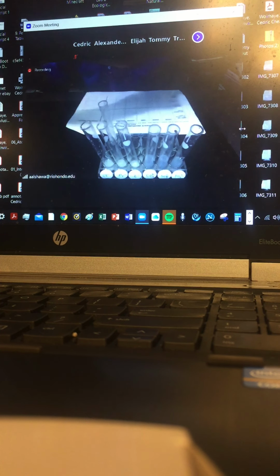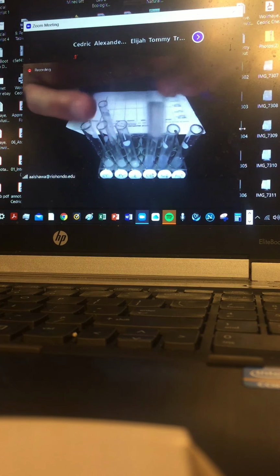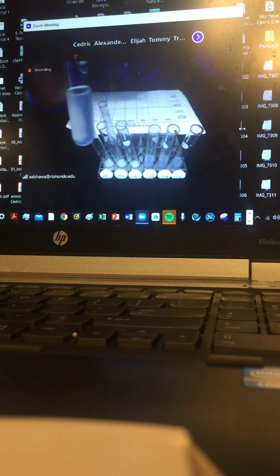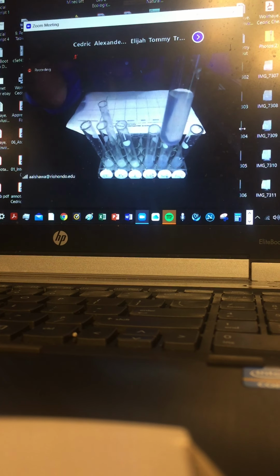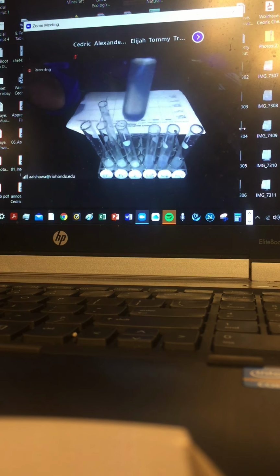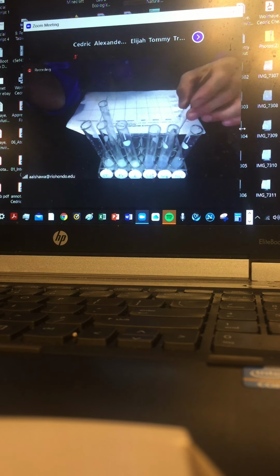I guess. So I have just a few drops. Like I got my dropper with a few drops of the 6 molar, but I don't have much of it. Okay, but obviously the solution is turning a little more clear than the previous. So previously it had some sort of a solid or cloudy background and starts to clear up a bit. Okay, so this is the outcome of unknown 2.